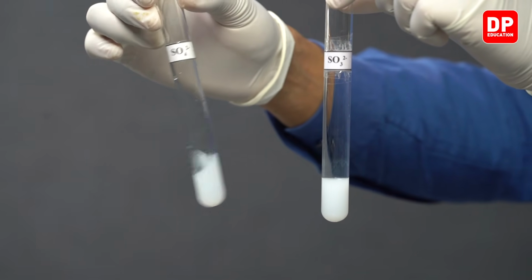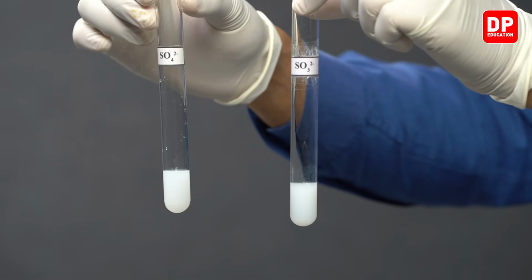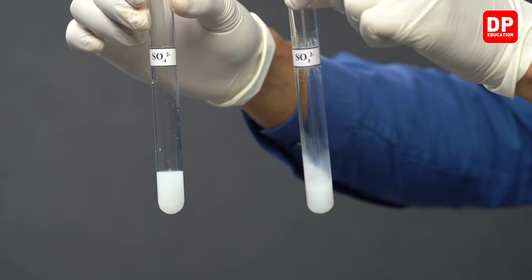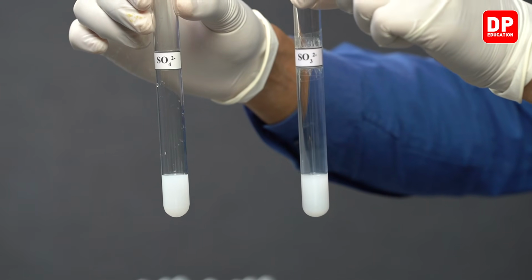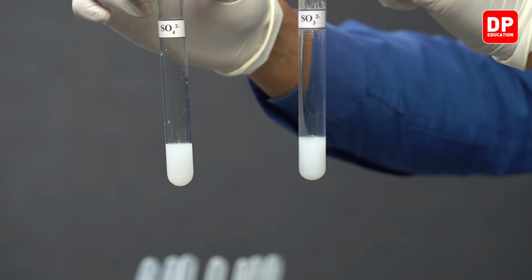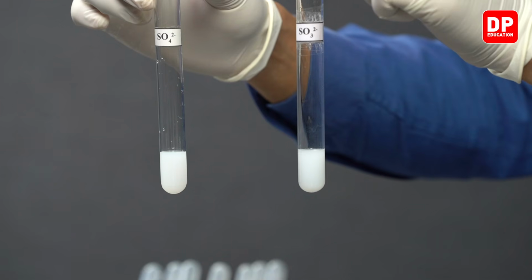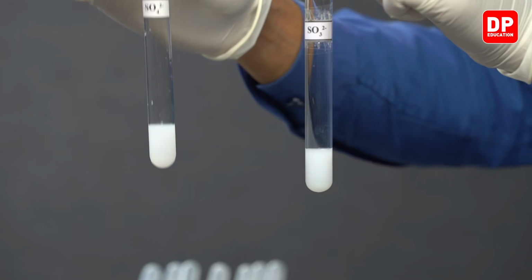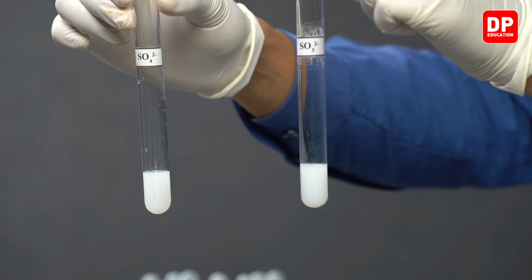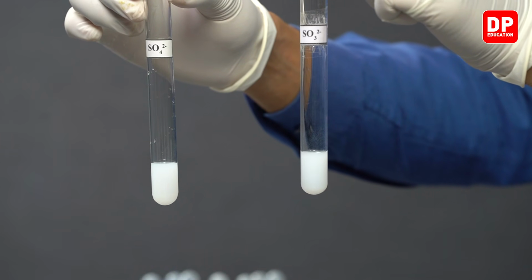A white precipitate was formed when we added barium 2+ ions to the sulfate ion solution, and when we added barium 2+ ions to the sulfite ion solution also, we can see the formation of a white precipitate, which is barium sulfite. So barium sulfate and barium sulfite both are water insoluble white precipitates.